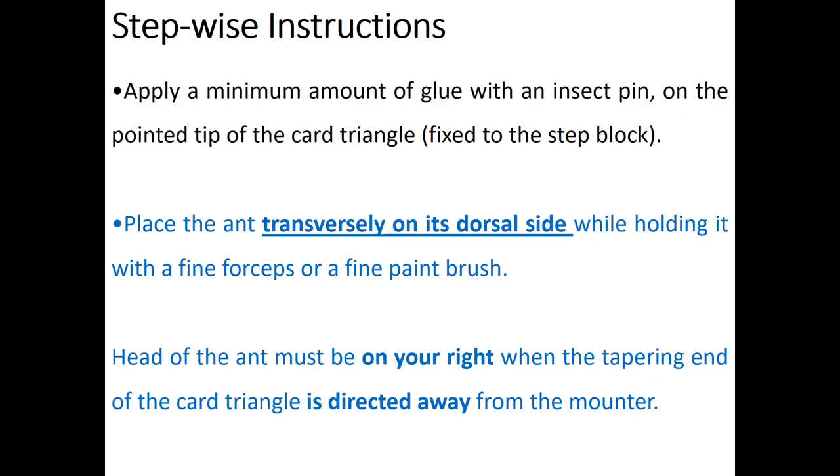So assume that the tip is directed away from you, and then the head of the ant must be on your right. Okay, right.